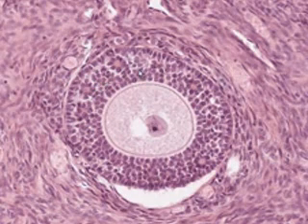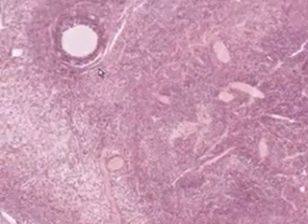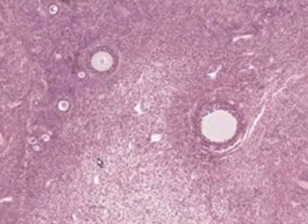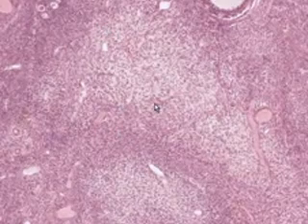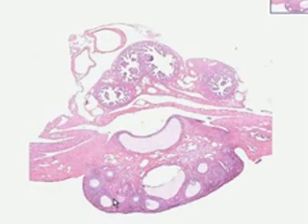When you start to see a separation in the granulosa cells to form an antrum, you could then call that a Graafian follicle. I do not see any Graafian follicles in this infant ovary, so I am going to quickly move. See, here's another secondary follicle. Here's another secondary follicle. But I don't see any follicles in which there is a significant antrum. So I'm going to move very quickly to another slide in which we will see it. And I think we're going to see that very soon.